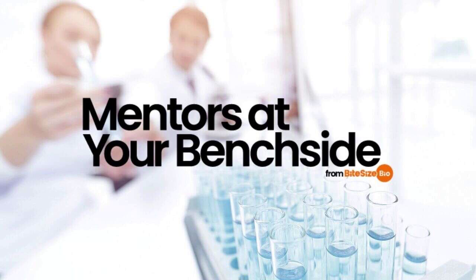Number two, use chloramphenicol according to Begbie. Begbie et al. have explored another, faster possibility. In the previous protocol, growing the culture will take you at least 36 hours. The alternative is adding a much lower concentration of chloramphenicol, 3 micrograms per mL. When you inoculate the main culture with your starter one, the sub-inhibitory concentration will slightly slow down your E. coli doubling time, but will not stop it. However, it will increase the copy number of your vector several times.